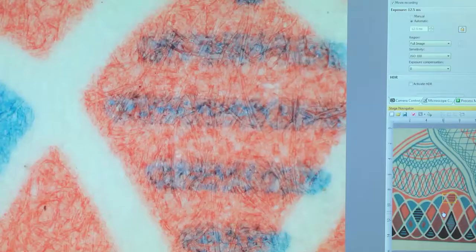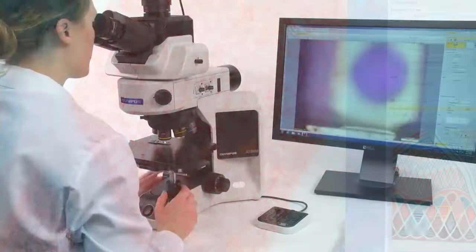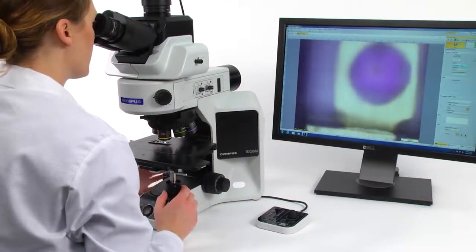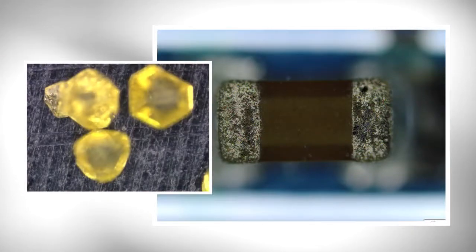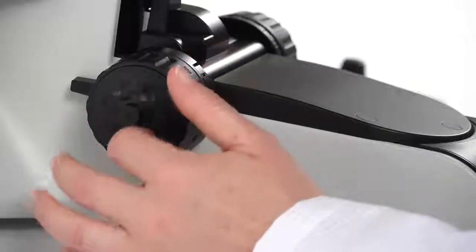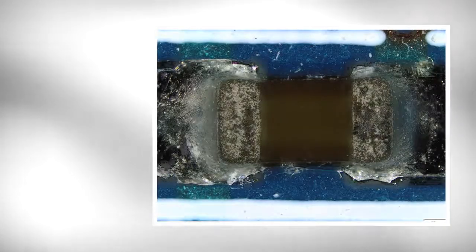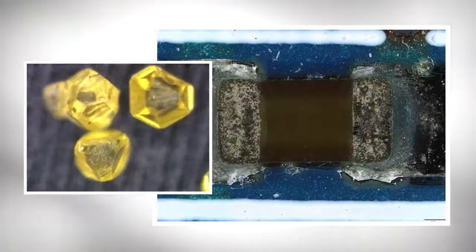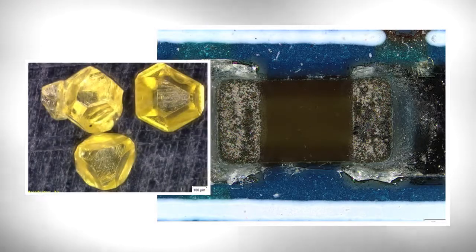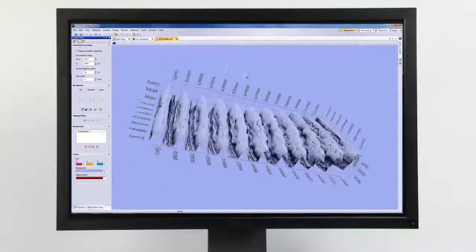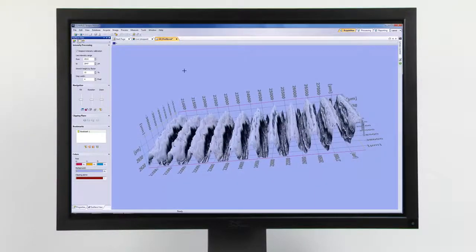When a sample's topography extends beyond the depth of focus, Extended Focus Image, or EFI, enables you to use the fine focus adjustment on the microscope and combine many images taken at different Z levels to create a single image that is entirely in focus. This acquisition can be viewed as a 3D image at various angles.